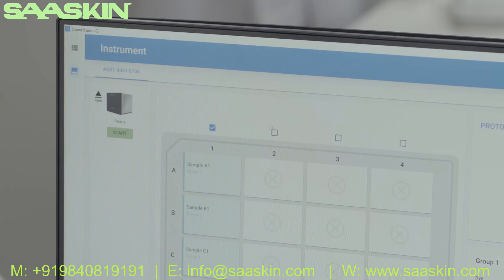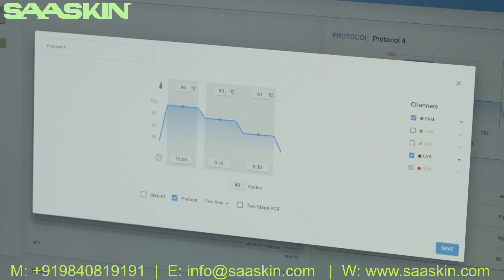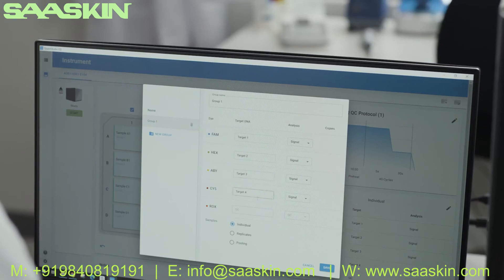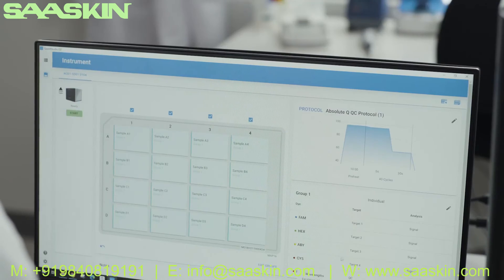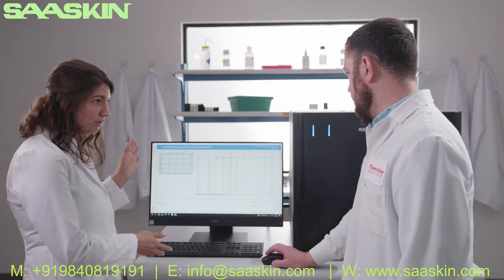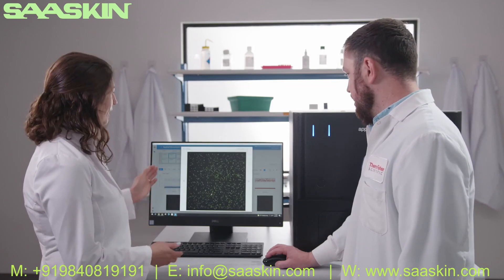The intuitive QuantStudio Absolute Q analysis software enables users to easily change and define experiment-specific parameters, name and track experiment details, and monitor the run from an easy-to-understand user interface. After the run is complete, return to view the results and apply powerful analysis software.